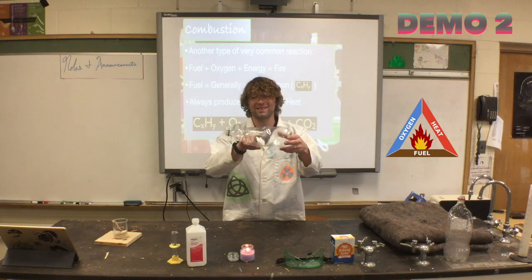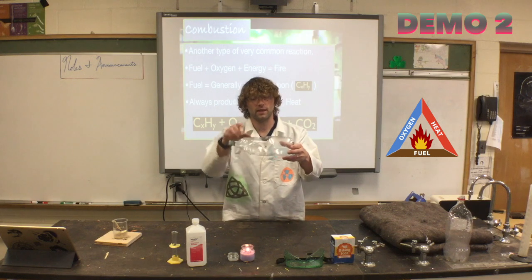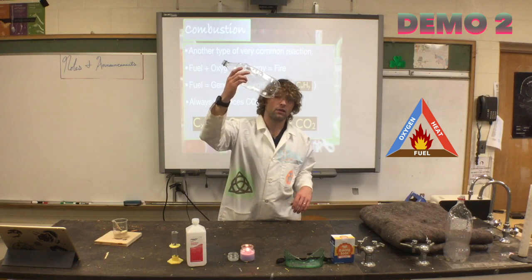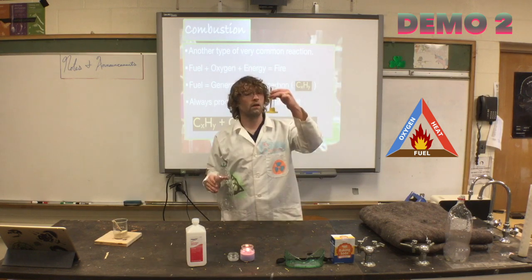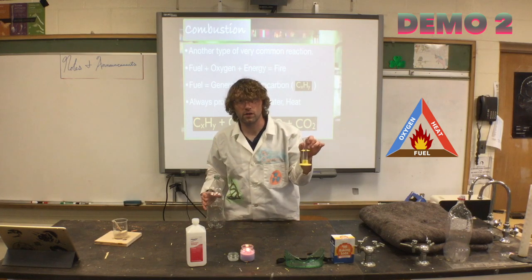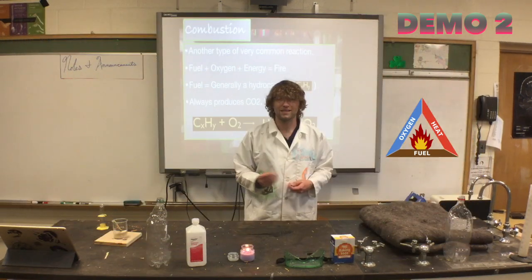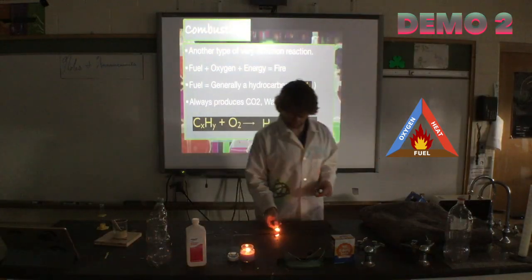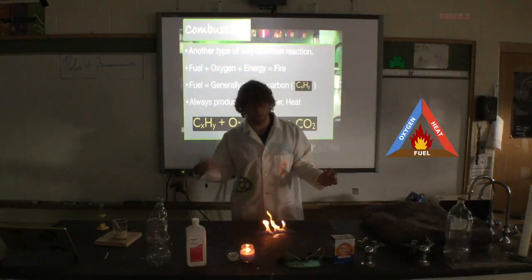The flame actually ended up inside of the bottle and melted this a bit and continued to burn inside. So that's one thing to keep in mind. The other thing to keep in mind is, as you can see, there's some residual liquid in here. It comes out to be about 2.5 milliliters, and what we would assume this is, is either leftover ethanol, which is what it smells like, or water if the water didn't evaporate. If there is any leftover ethanol, we should see this ignite. Aha!